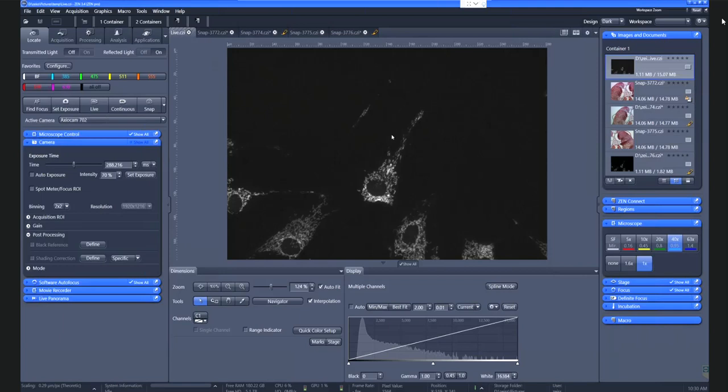Okay, so some of you might get worried why we do see mitochondria which are stained with a RFP label shown in white only.